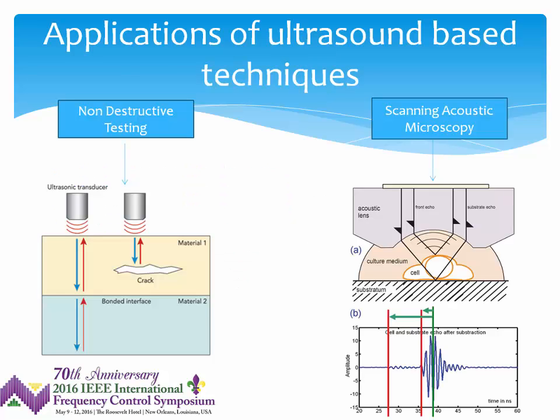So ultrasound-based techniques, of course, have been widely applied to a variety of problems, and Sister Conference probably has a lot more papers on the applications of ultrasound-based techniques to areas such as non-destructive testing and in an imaging modality to scanning acoustic microscopy.